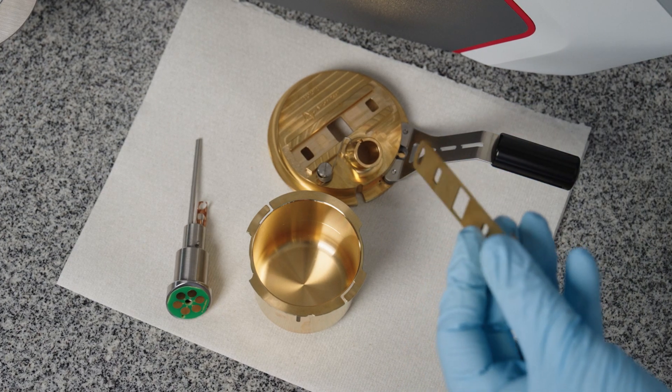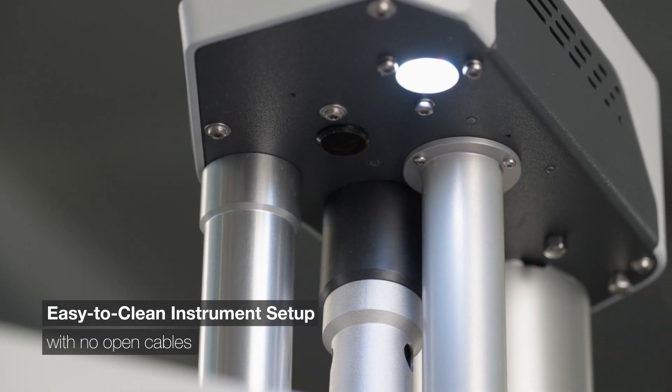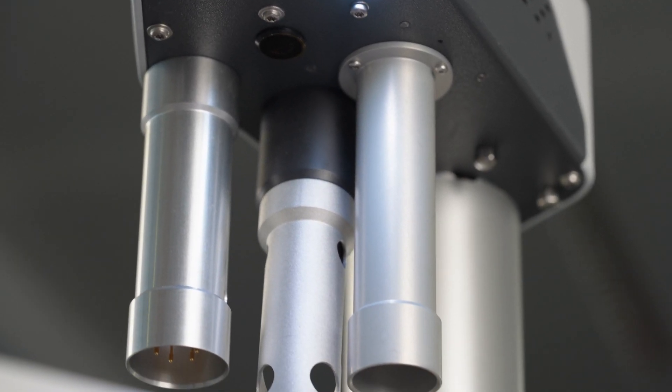Save time for more important tasks with simple cleaning setup, and keep an eye on your measurements from afar with the convenient measurement monitoring status light.